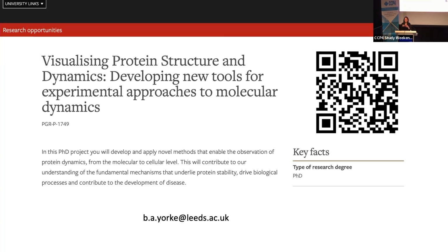So just keep going and trying to catch it along different parts of the reaction. What's really interesting to me now is trying to see the difference between light and dark and actually capture the mechanism of the photochemistry that's happening as well.